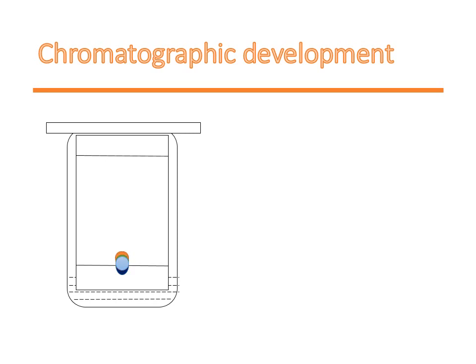The sample which is applied might be containing 2 or 3 components. These will have different solubilities in water and the mobile phase which is used. So depending upon their solubility, they travel different distances. The component having more solubility in the water, that is indicated with the orange colored spot, will be retained immediately.